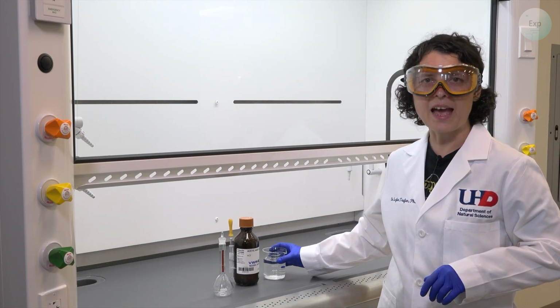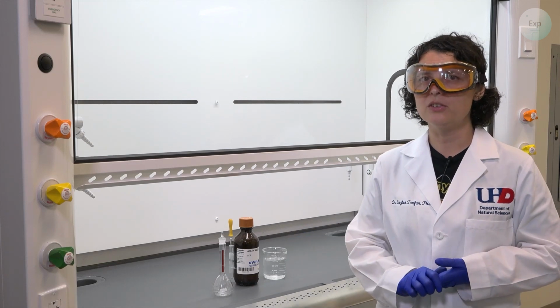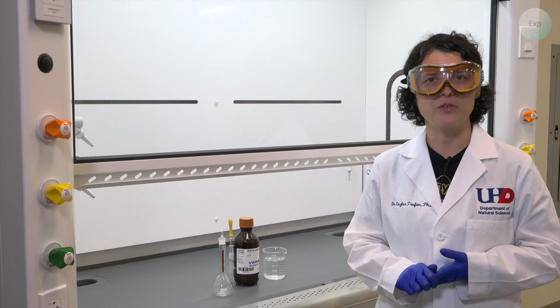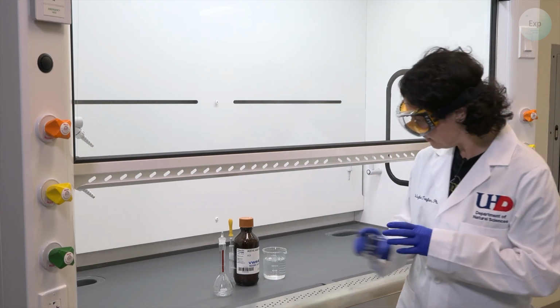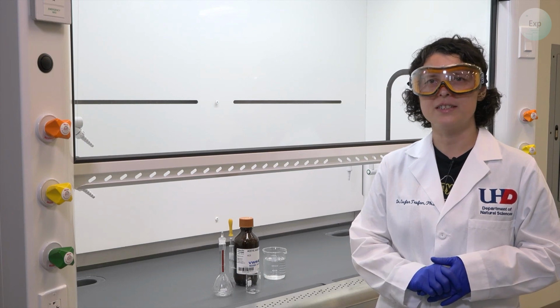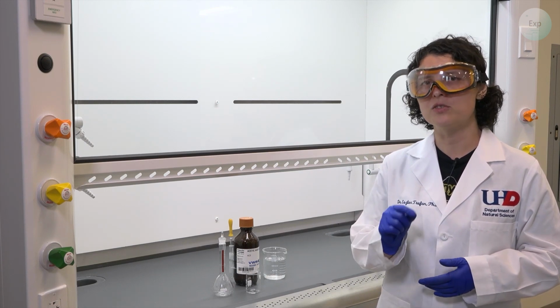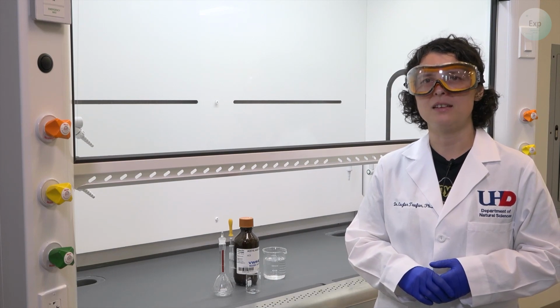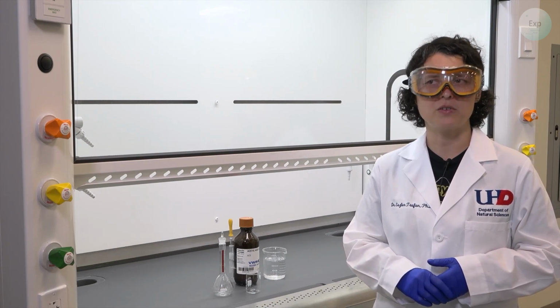For glacial acetic acid, we're going to use a separate beaker so that we don't insert any pipettes or micropipettes inside the original container. And because of the high concentration of glacial acetic acid, we will be using a very small amount of it. So that means we need to use a micropipette instead of a graduated cylinder to measure out the original amount.